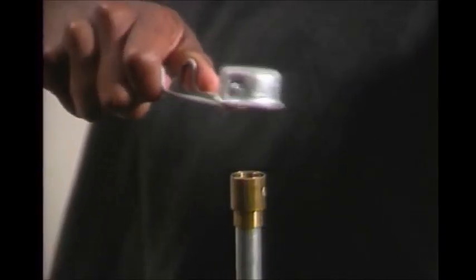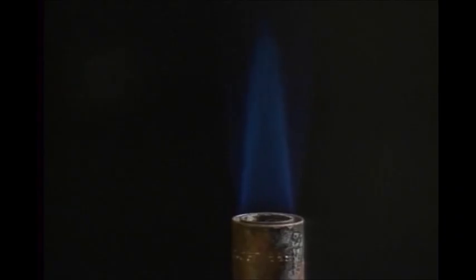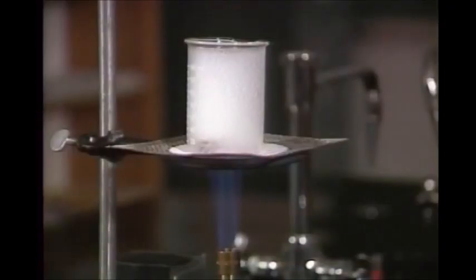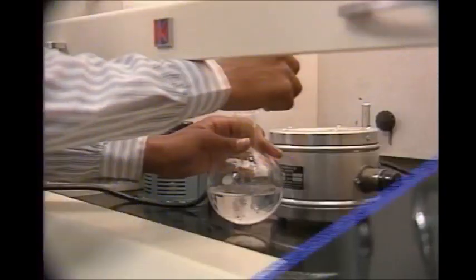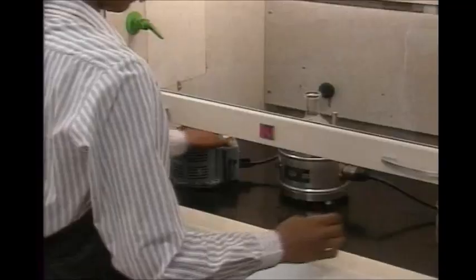The main heat source in most chemistry labs is the Bunsen burner. It produces an open gas flame burning at a high temperature. There's always the danger of an accident if it's not used properly. For example, it should never be used to heat volatile organic liquids that give off flammable vapors. These substances should be heated in a heating mantle or a steam bath in a hood.